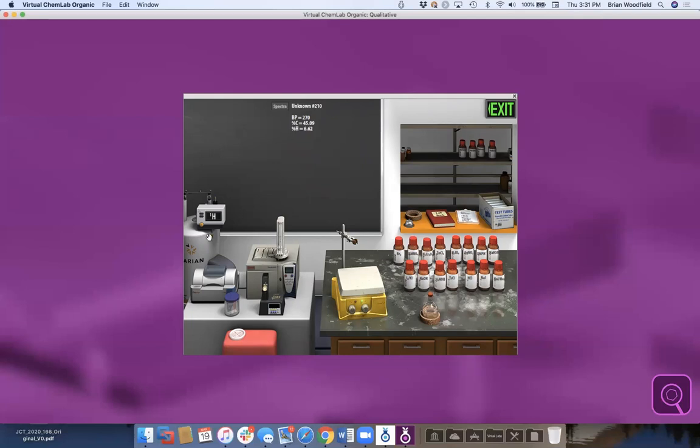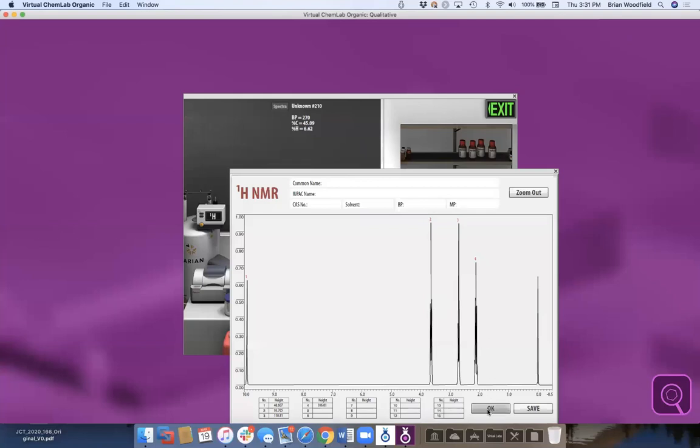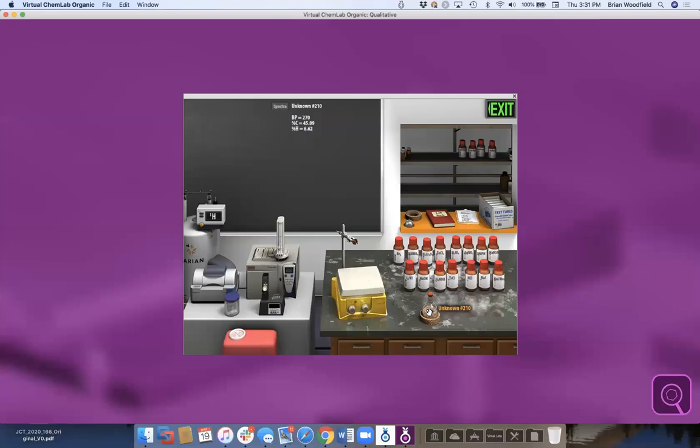So we can, again, do your spectra if you want. Here's your NMR, but you can also do these wet tests. So I take an aliquot, put it up here on my stand, and I can go through and do each one of these wet tests. So here's a Jones oxidation. I take it and I add it, and we show a still picture or a video. We show a video when time is important, that shows the results of a test. And so this one's positive.